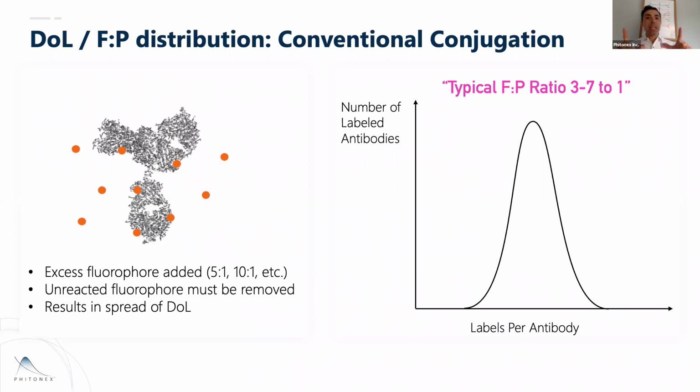And if you think about that, it's not just PE. PE is big, so it's easy. You put one PE on one antibody and it occludes the other PEs from binding. It's not the case with some antibodies, but that's a pretty big variability to have on the number of fluorophores you have on a protein. And the way I think about this is that's variability that you have before you ever even get on the cytometer, because there's a Poisson distribution of these fluorophores on the antibody, right? It also affects cost, because to make these things, you've got to add excess fluorophore to the system to bind them onto that. And for what it's worth, in custom programs, this also might lead to free dye coming out the back end because you do have that excess, right?